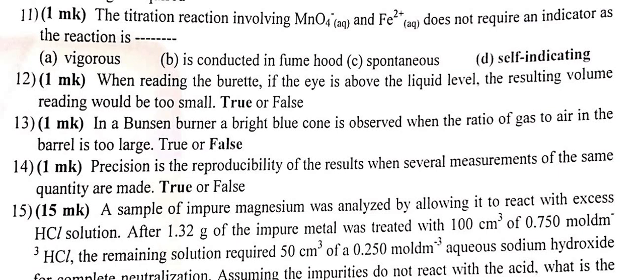What's the best response here? Is it true or false? When we read it, it's true, right? Why is it true? Yes, because the angle at which you're looking at it from is not going to be accurate. No wonder we try reading it at eye level. You need to be at liquid level.